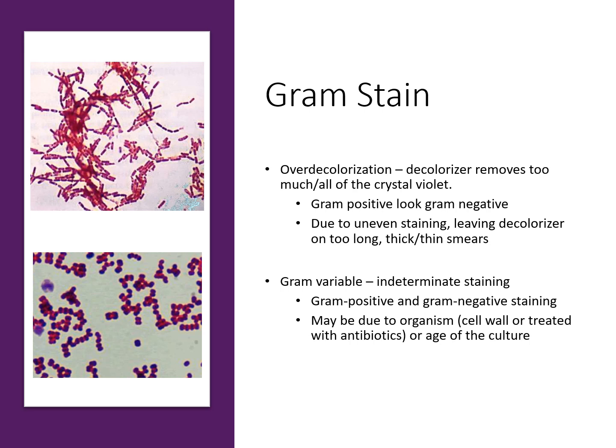If you over decolorize the specimen, you've let that decolorizer run on that sample too long. So when you're running it over and you see that purple color come out and it kind of stains that decolorizer a purplish bluish tint, if you keep putting that decolorizer on it after you see that it has started to run clear, then you'll actually start to remove the color from the gram positive, which could in turn get stained, and they would appear gram negative.